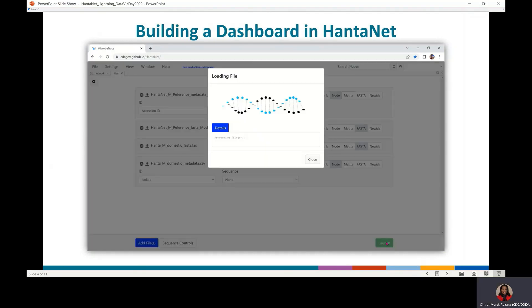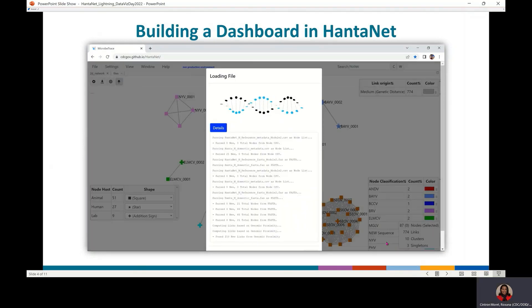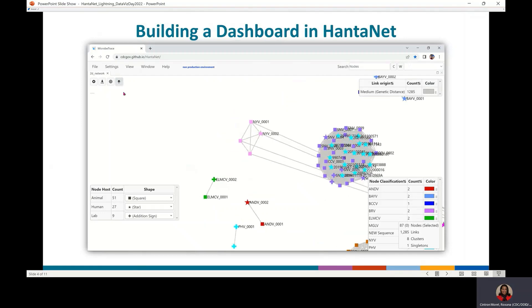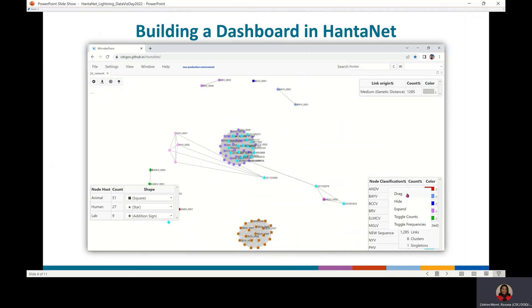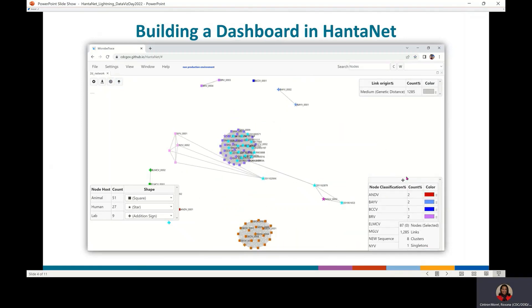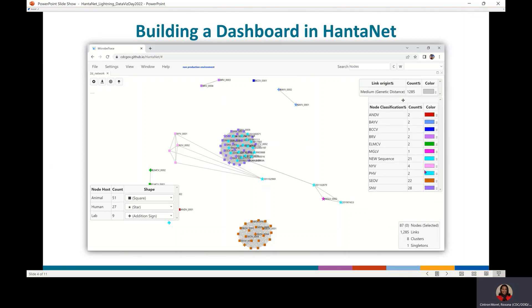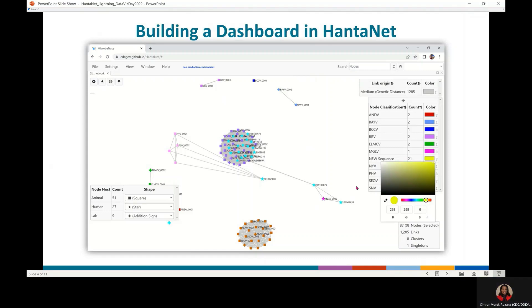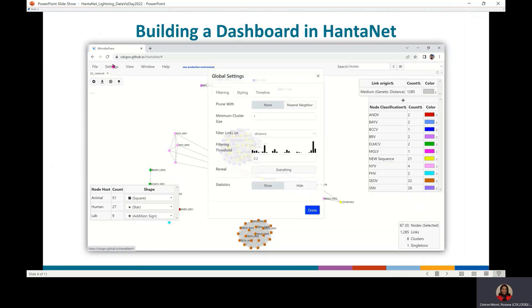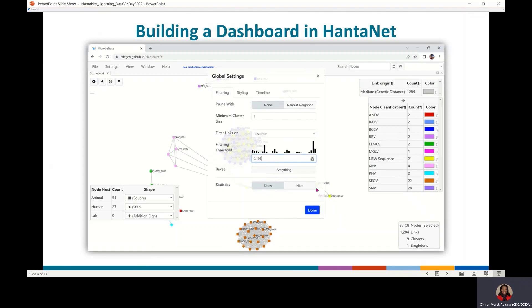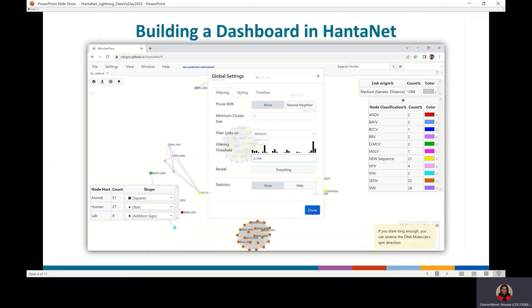Relaunch the module and, if needed, unpin the nodes and centralize the network. You can change the color of the nodes representing the new sequences — for example, I changed the node color to yellow. There are two different strengths in this cluster, so I decreased the genetic distance cutoff to remove the link and separate them.